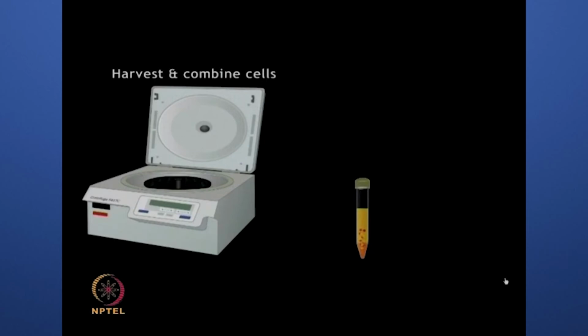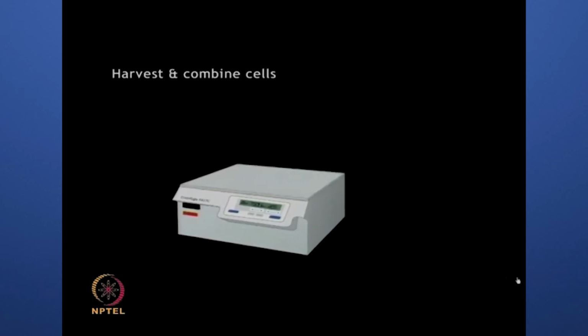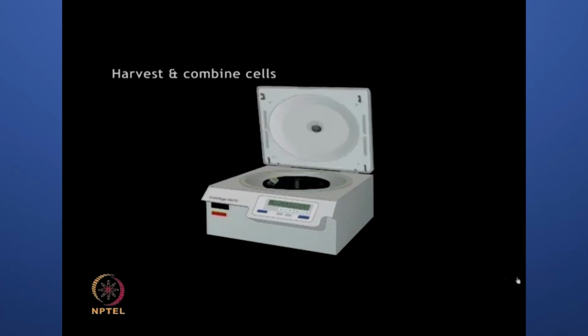The medium containing the heavy amino acids will give rise to heavy isotopic proteins. After a number of cell divisions, all the instances of particular amino acids will be replaced by the isotopic analog. The grown cells can be combined together and harvested. Centrifugation of the mixture will result in pelleting of cells, which can then be used for further analysis.